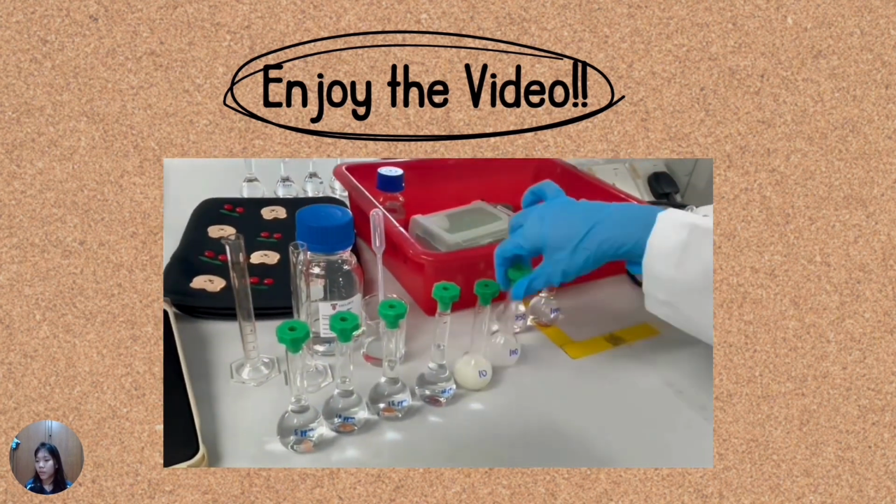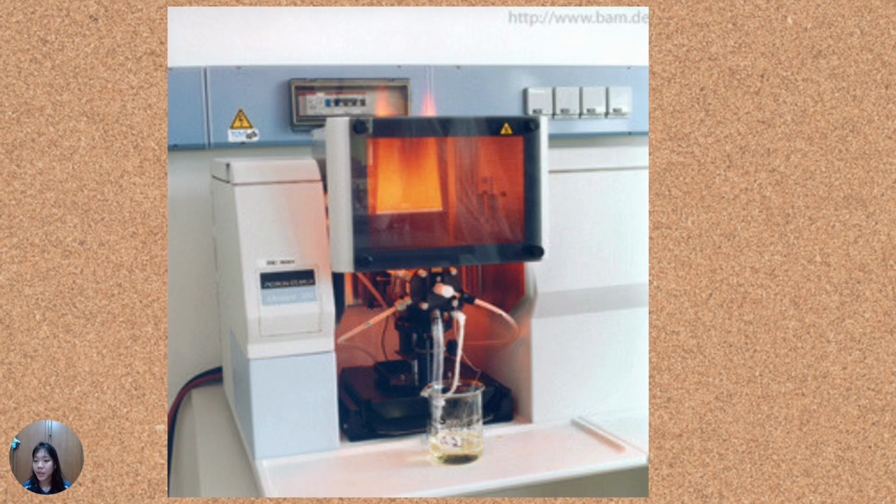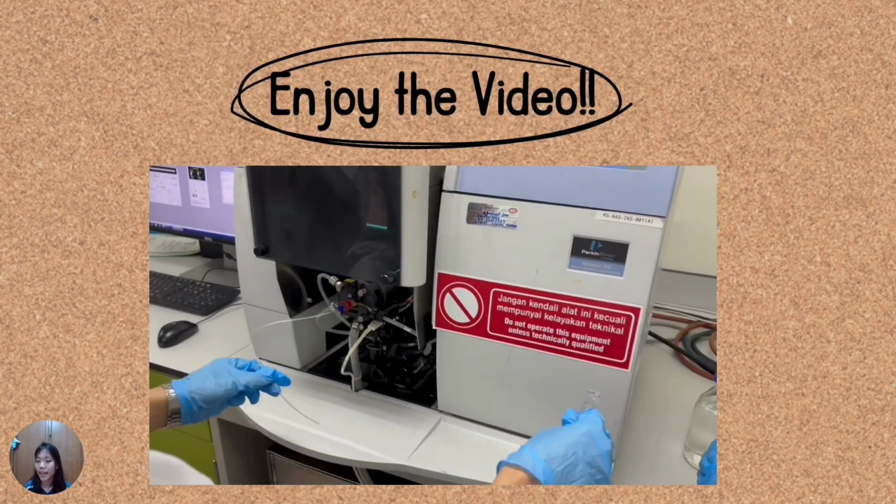After the dilutions were made, we were the first group to use the AAS to determine the concentration of calcium in milk. Ms. Neal taught us how to use the machine, and each of us gained individual experience in operating it. While the machine was running, we observed changes in the color of the flame and light. Let's watch a video.